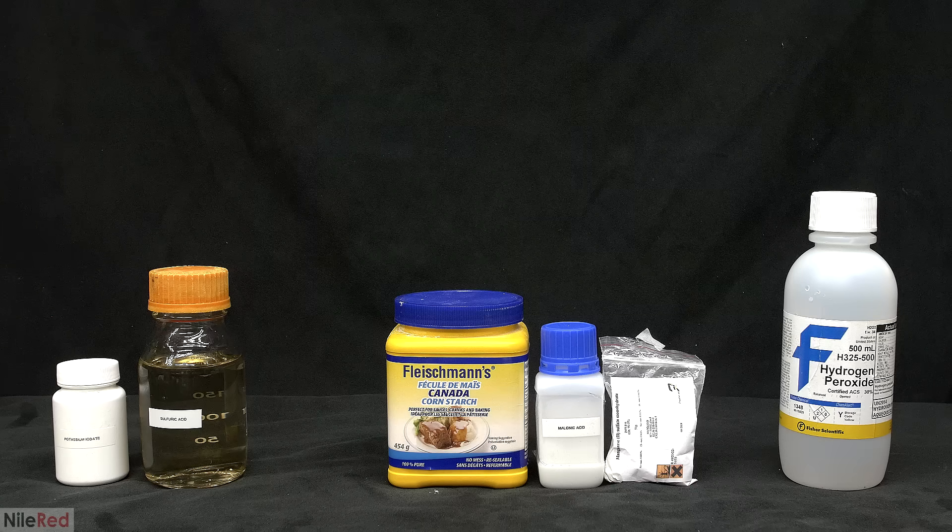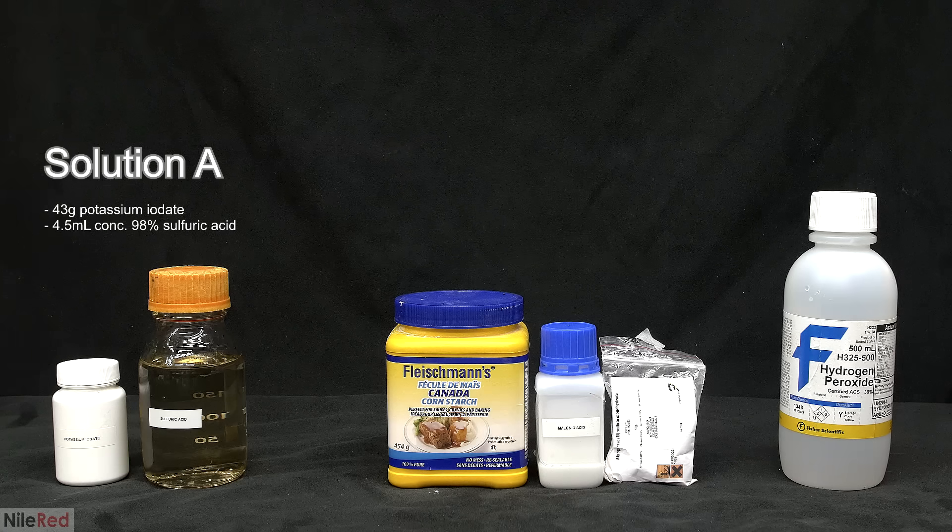For this reaction we need to make three separate solutions and these are all the ingredients that I used. For solution A I used potassium iodate and concentrated sulfuric acid. Concentrated sulfuric acid is normally colorless but mine got a little bit dirty so it has this yellow tint. Although it's discolored it's still quite pure and it will work fine for this reaction.